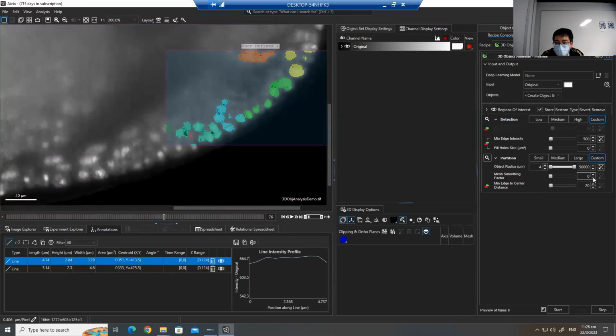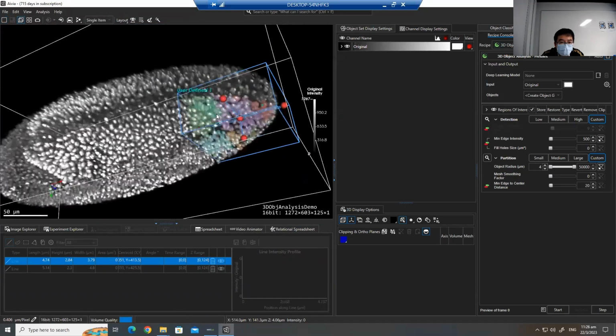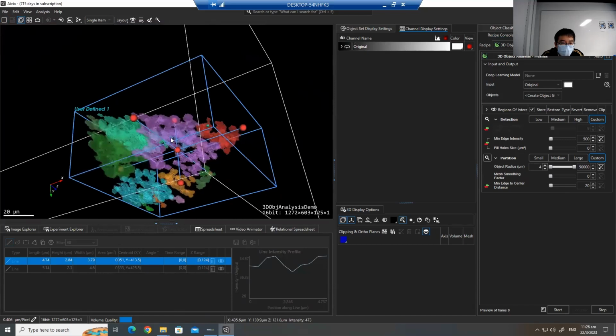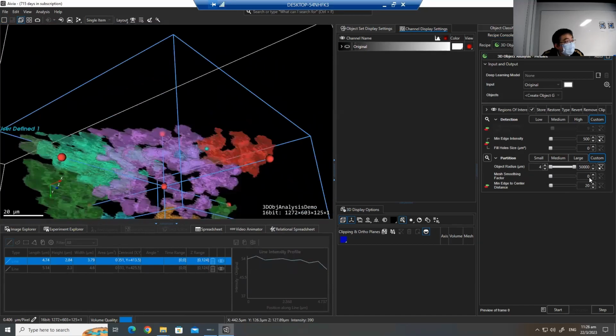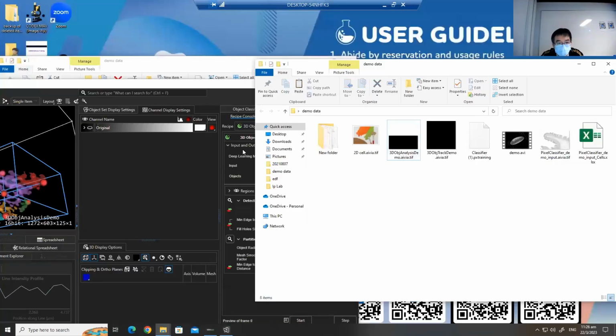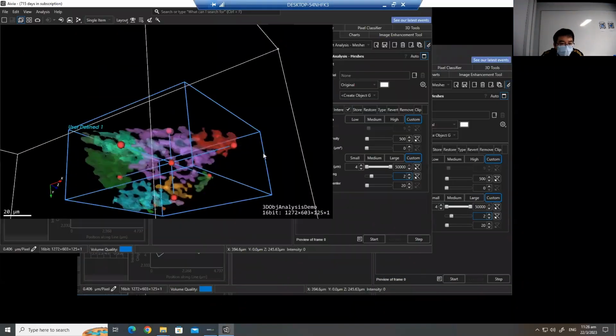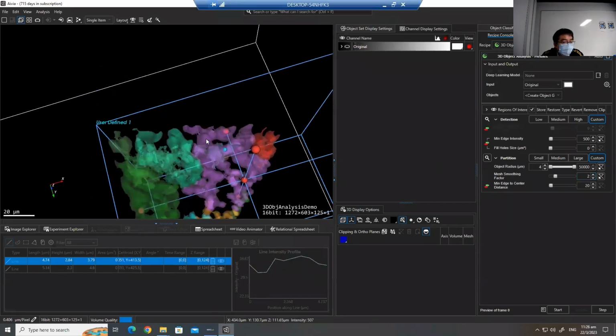And then the mesh smoothing. Let's preview in 3D. Now we see that the object looks very pixelated because we have 0 smoothing here. To smooth the 3D model, we can, let's say, increase it to... okay, we lost the connection again. Now it's 1:2. It looks smoother than before.